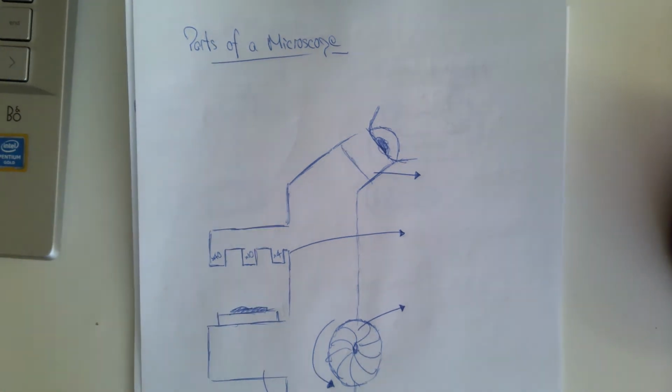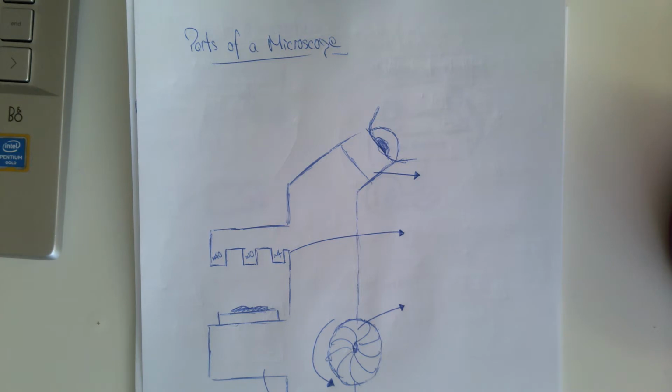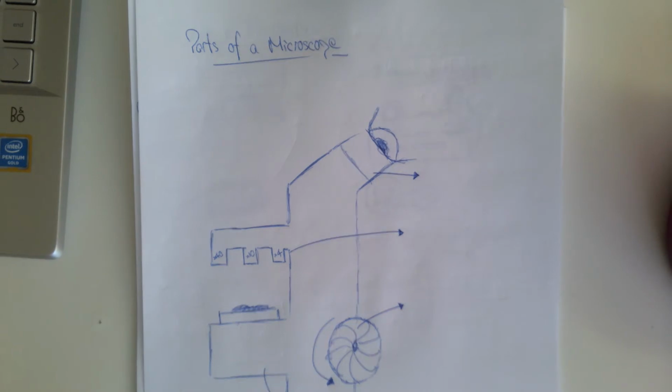Right, so welcome to our online tutorial looking at the parts of the microscope. Now, as this is a revision tutorial, you'll be just trying to remember back to times when in school you have utilized microscopes and the aspects of microscopes you need to know in terms of names, their function, and then in a later tutorial as well, how you go about using them to prep slides and prep specimens.